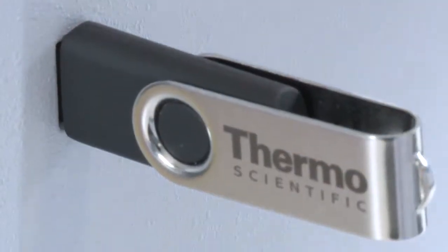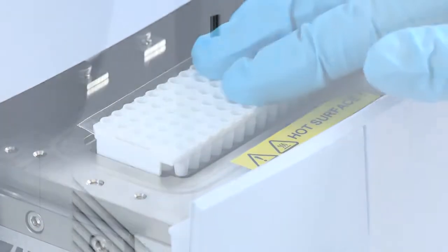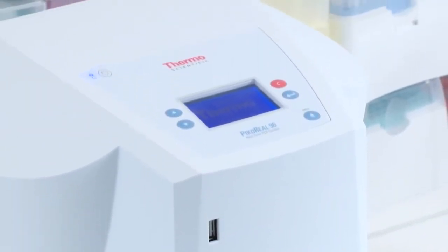The ThermoScientific PicoReal real-time PCR system is a high-performance qPCR instrument with a small footprint to fit on your personal laboratory bench.